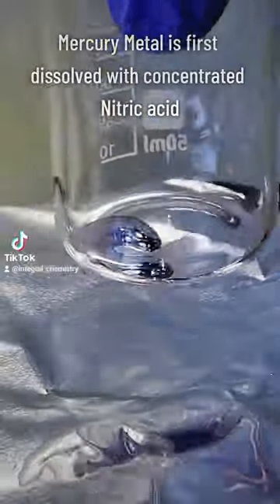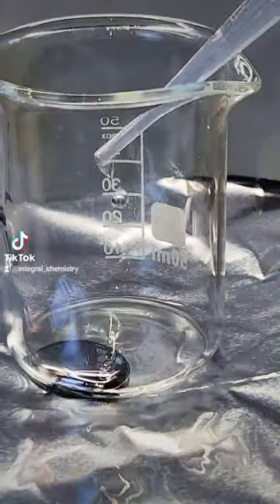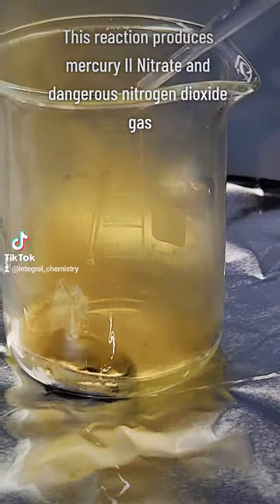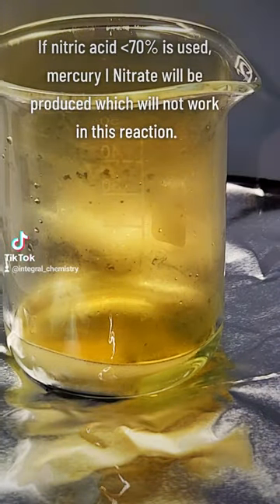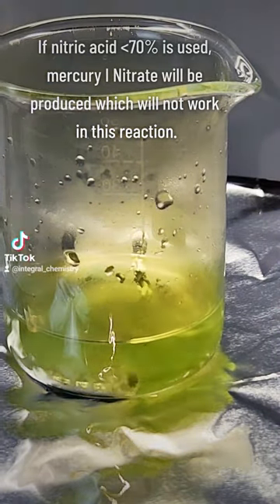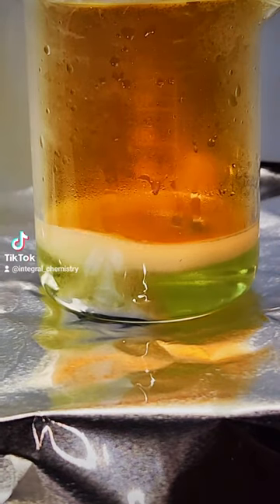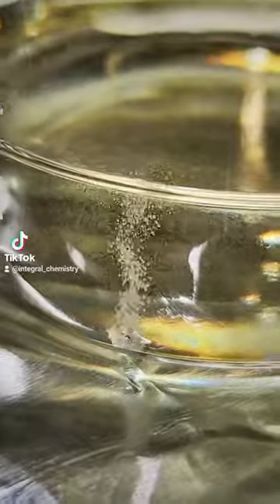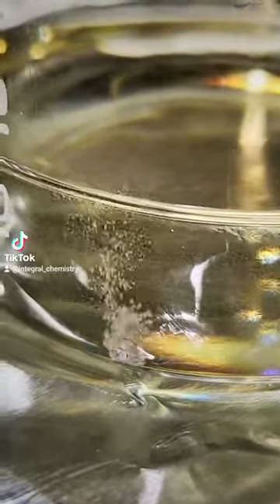In any case, to get started I first need to dissolve my mercury metal using concentrated nitric acid. This reaction will immediately produce dangerous nitrogen dioxide gases as well as mercury 2 nitrate. It's very important that concentrated nitric acid is used here, because if weaker nitric acid is used your product will be mercury 1 nitrate, which won't work for this experiment. You can determine what you produce by adding a few drops of this to some water, as mercury 1 nitrate is fairly insoluble compared to the 2 nitrate.